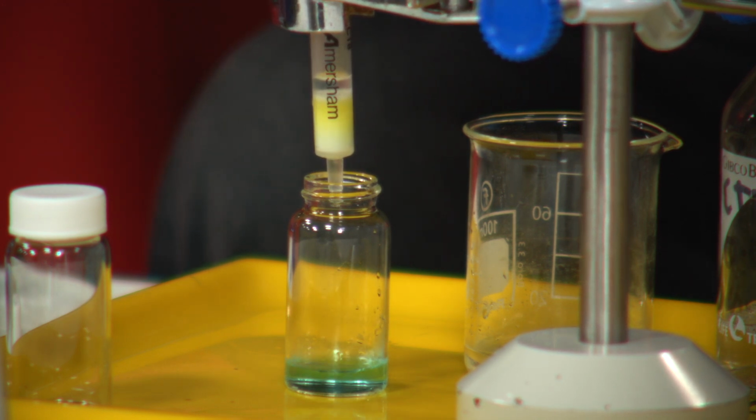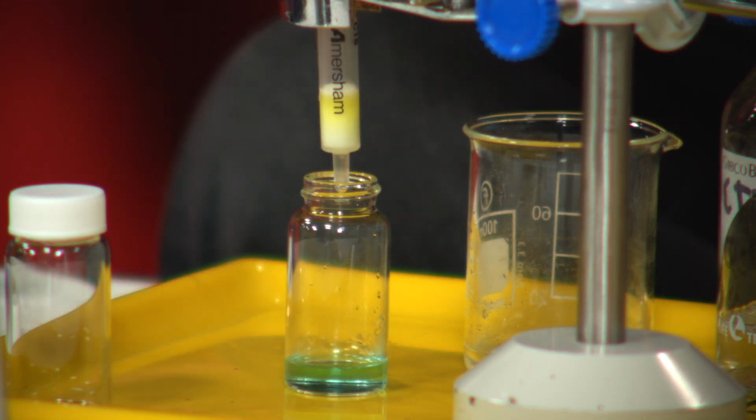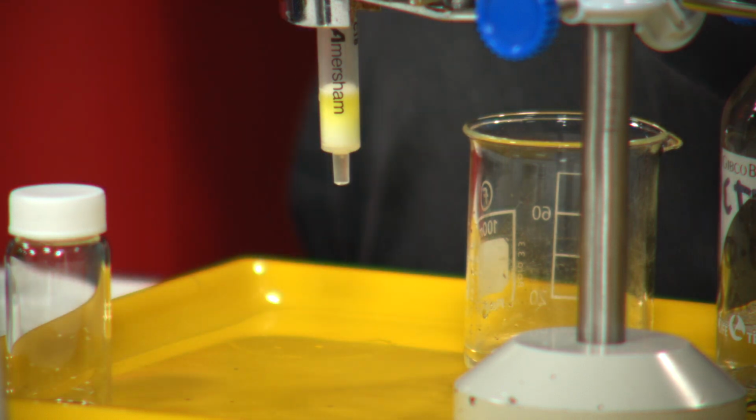that will be good. So hopefully you can now see that most of the blue, or virtually all of the blue has come off, and the yellow has really remained stuck to the column. So what we're now finally going to do is change the solution again to solution number 2, and use that to pull off the yellow.